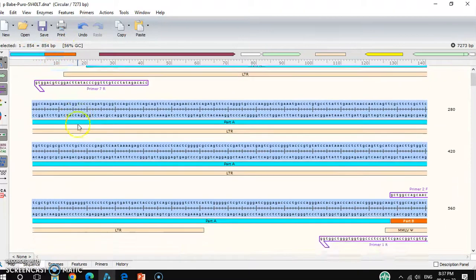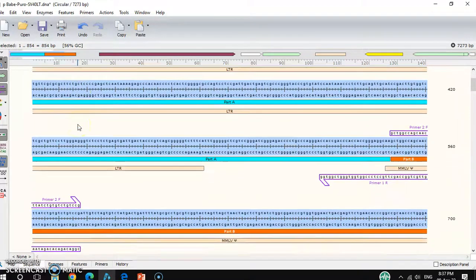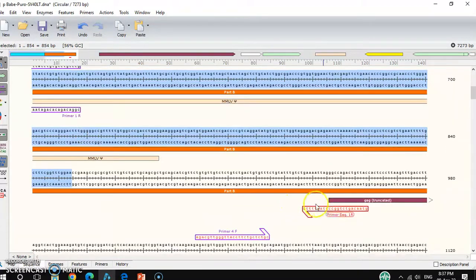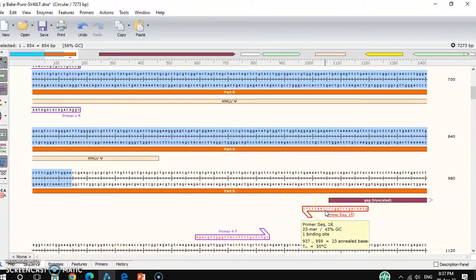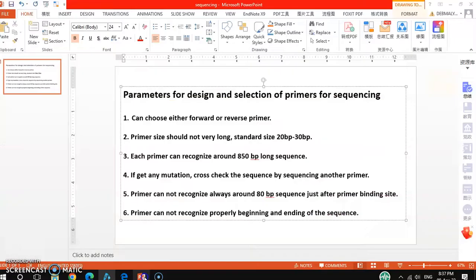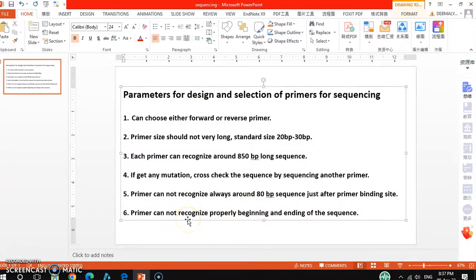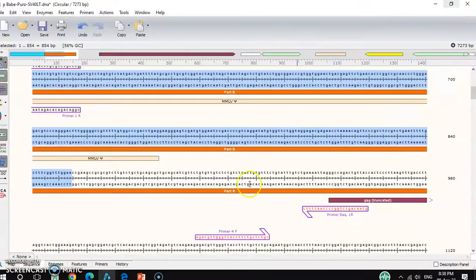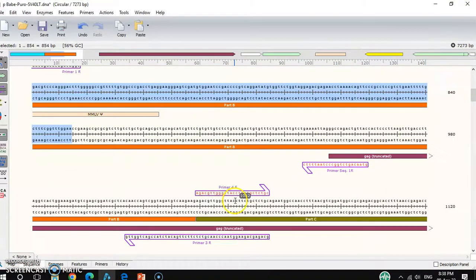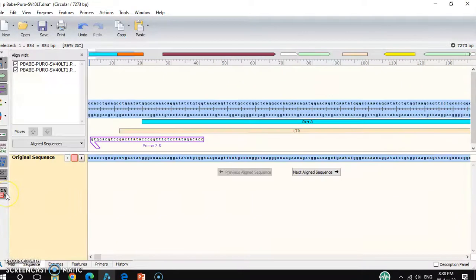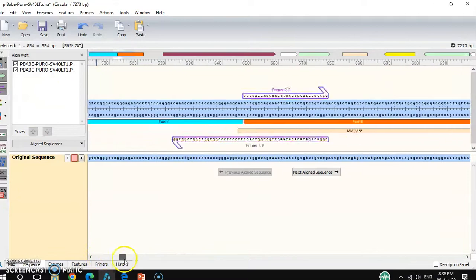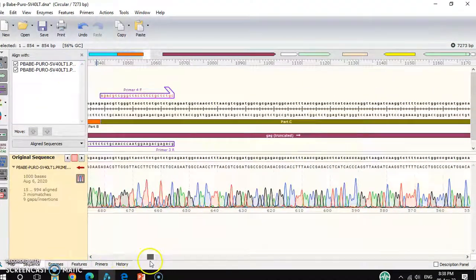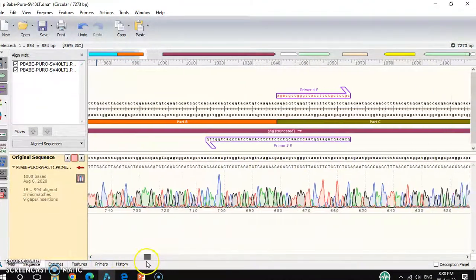This area can be covered by this primer. Another point is the primer cannot recognize properly at the beginning and ending of the sequence. It always happens, but it varies which sequence it cannot recognize properly, and it depends.